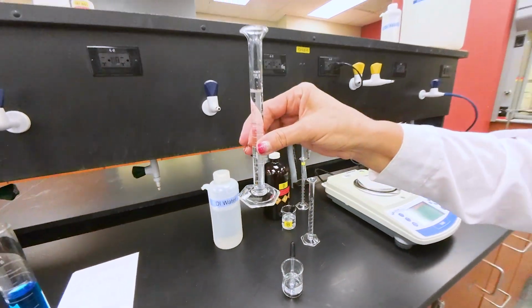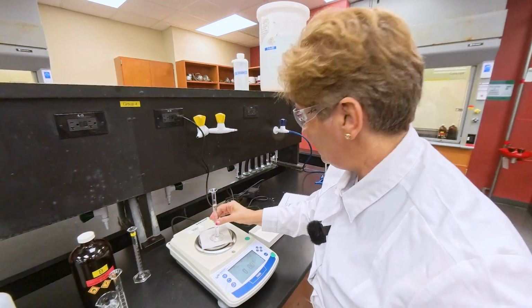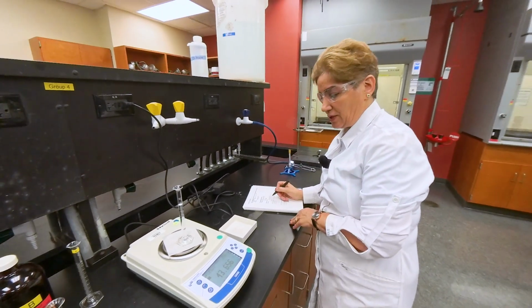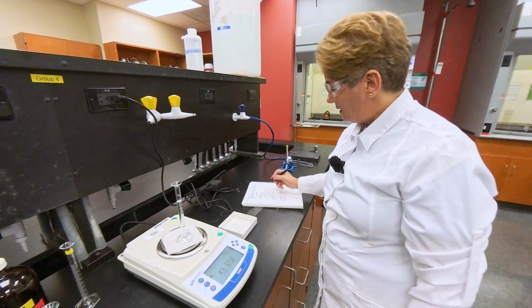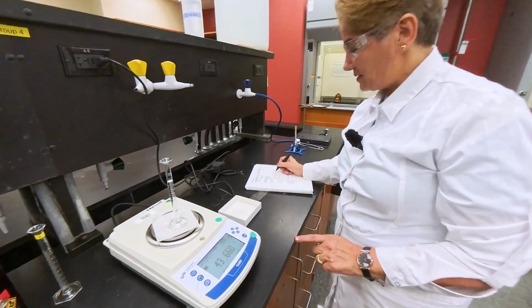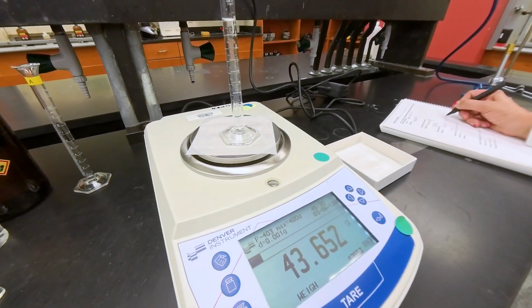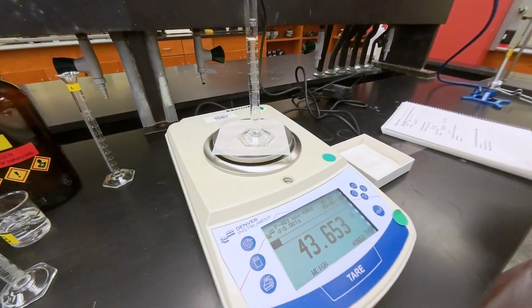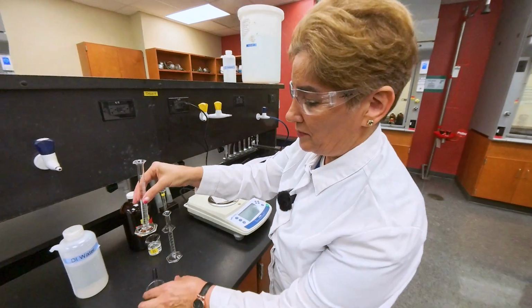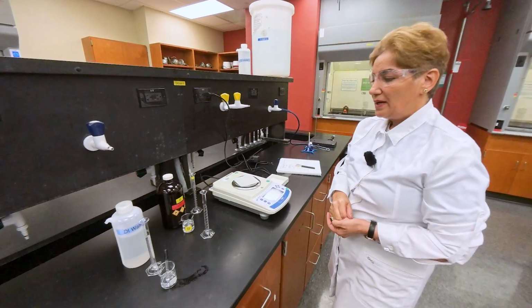So I have 10 milliliters exactly. You record this number. It's given, it's 10 milliliters. And you measure the mass again, and the difference is going to be the mass of water. When you have the mass before and after, and you have the volume, you can calculate density.